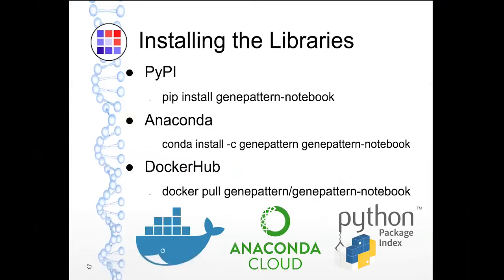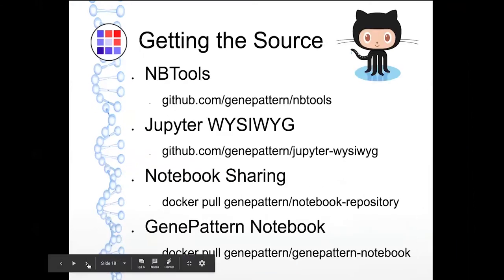You can install all of our tools you saw today on your local computer through either the pip or conda package managers. We also have the full stack available in a Docker image, and that's up on Docker Hub. You could run a notebook for just yourself, or even set up your own instance of the Notebook Workspace for your lab. And finally, the source code for all of this is on GitHub. Documentation is available right on GitHub and linked from each repository's README.